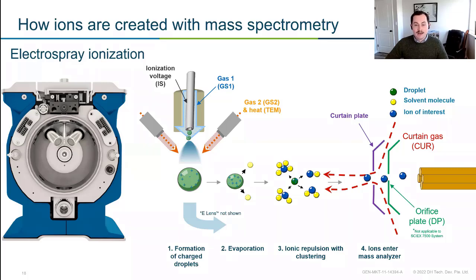We really want to separate that because we're only interested in our ions of interest, so we can pull those ions through our mass spectrometer, where they would be introduced and we can do some experimenting with them. All electrospray ionization is doing is helping us get that ion in a charged state so we can now pull it through our mass spec.